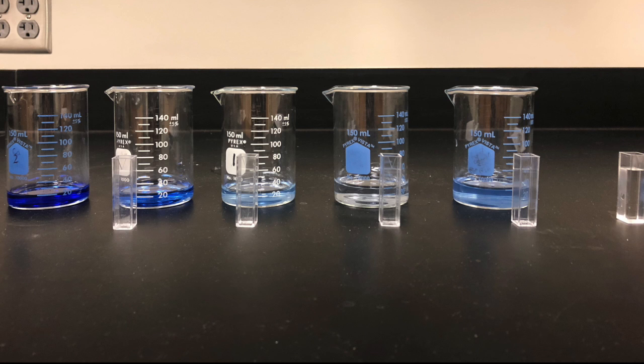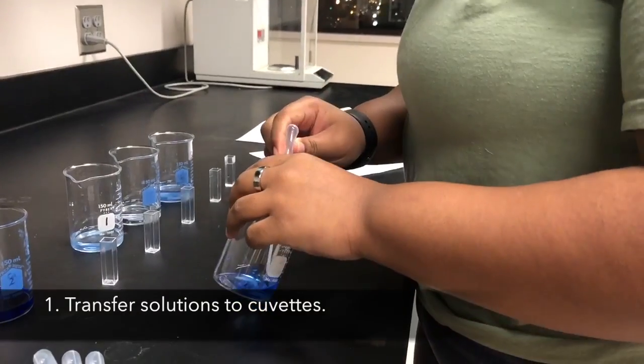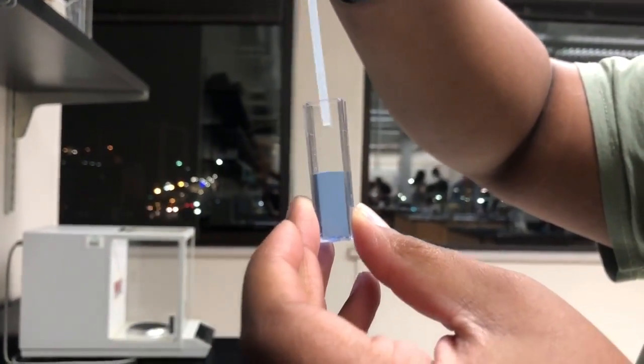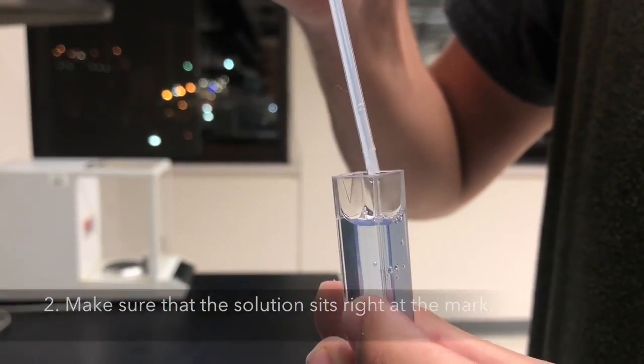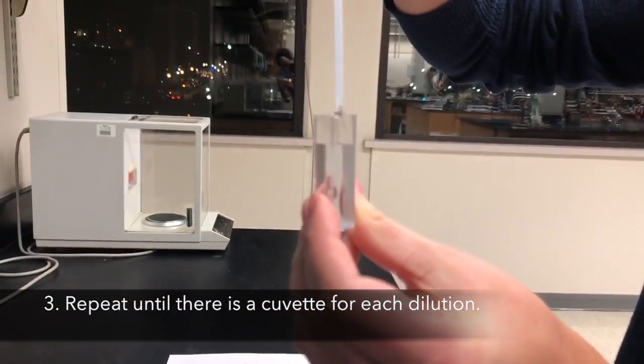In order to use the spectrophotometer, you must transfer your dilutions into cuvettes. You will need a cuvette for dilutions 1 through 3, your unknown, and a blank of distilled water in order to zero out the spectrophotometer. Begin by pipetting the dilutions into their respective cuvettes. Make sure not to put too little or too much in each cuvette. Fill them exactly to the mark. Repeat this until each dilution and blank has its own cuvette.